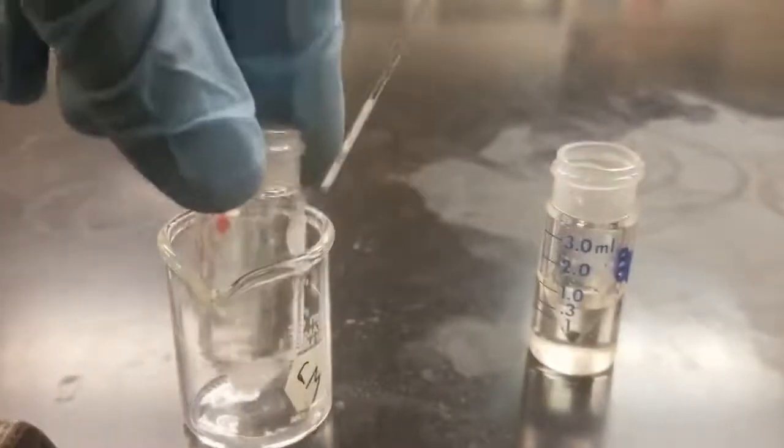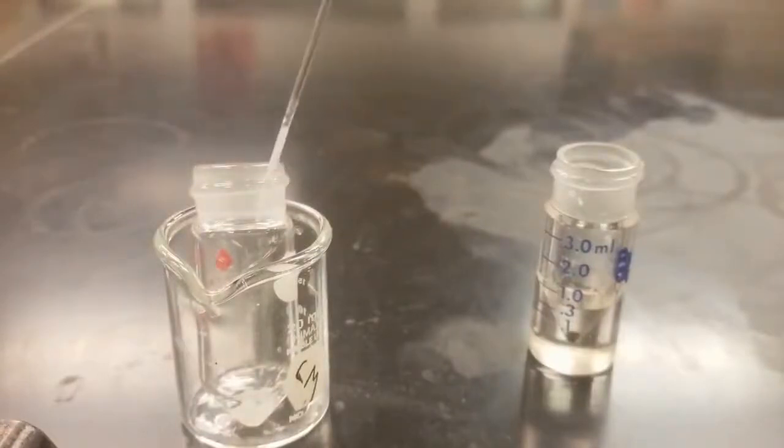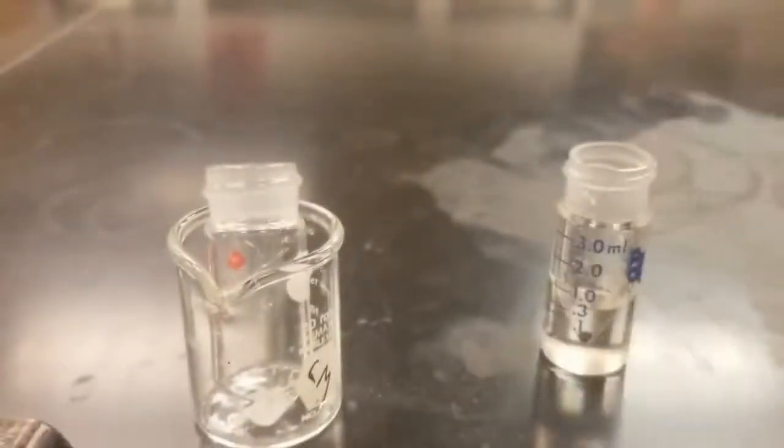And then we're going to add another 600 microliters of methylene chloride to wash this off. You can see that the DCM, the methylene chloride, dries quite quickly. So you can see we've got some benzoic acid in our pipette. Hopefully we can wash that off in this next step.